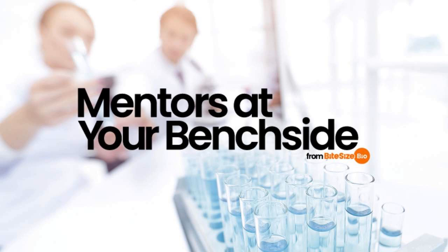To ensure your final data is valid, always aim for consistency in your counting technique, such as a cell counter specifically designed and validated for hepatocytes. Investing time and effort in optimizing your preparation process will help you get accurate counts. So, here come some practical tips for optimizing hepatocyte extraction via a perfusion protocol.